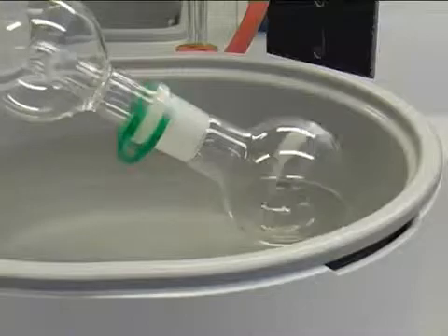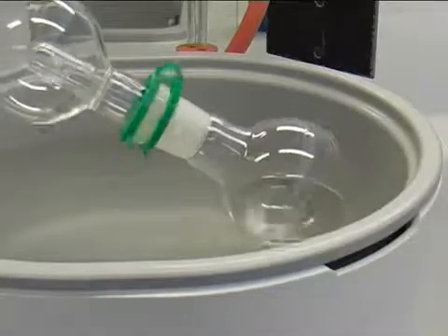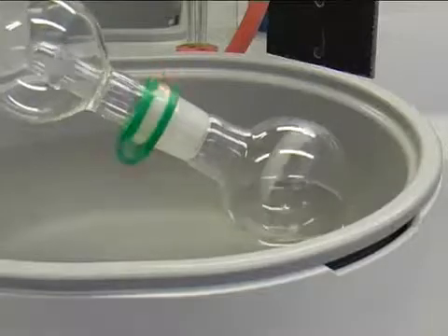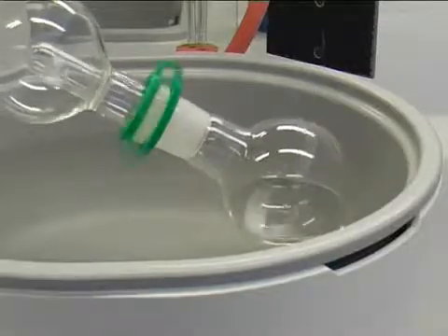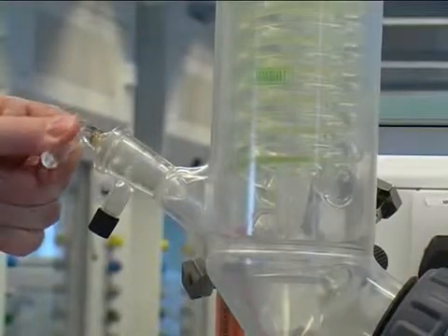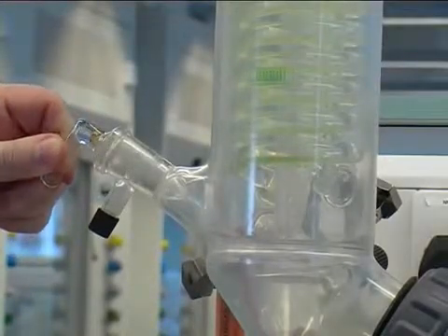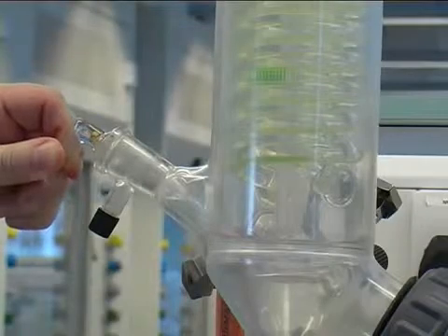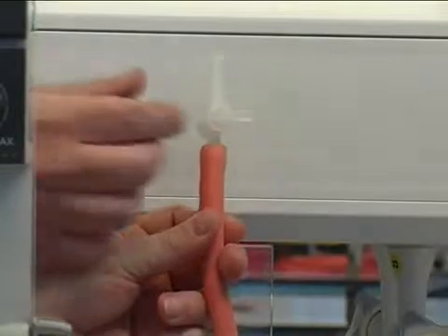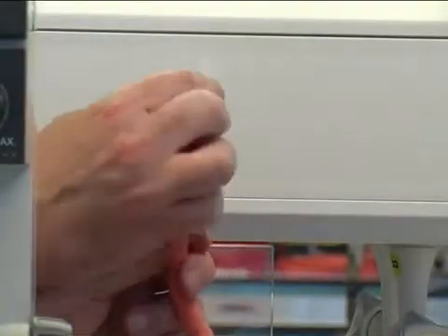You will recognize that the evaporation of the solvent has finished when no more liquid evaporates out of the rotating round bottom flask. Either when your solution is bumping or when you are finished, you open the glass tap at the condenser, and when you are finished you will also open the Teflon tap at the end of the solvent trap.